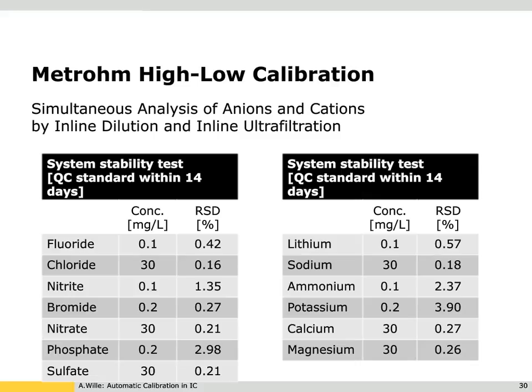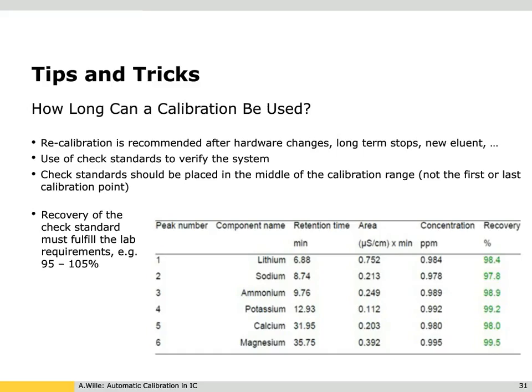Now to show you some tips and tricks for calibration in ion chromatography itself. For example, I get quite often the question, how long can I use a calibration in ion chromatography? A recalibration is recommended after every change in the system. It can be a hardware change or a long-term stop or a new eluent. Of course, not every time after you use a new eluent you recalibrate your system.